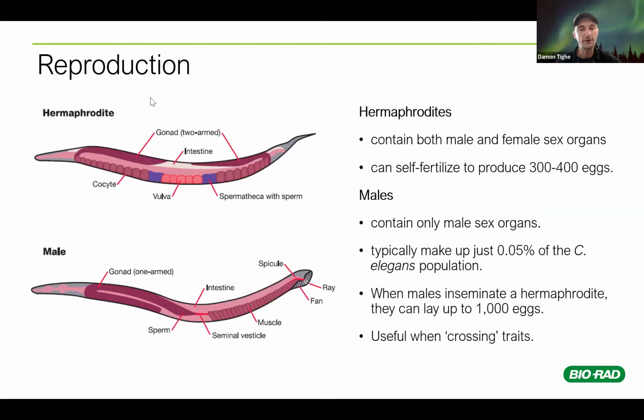The way you can tell them is that under the microscope, the males will have a fan tail at the end. And like Lee said, she's never seen one. I've only seen one when I was visiting a high school and they were running this. So they are kind of like an Easter egg hunt, mythical to find. Yeah, they're magical. They're basically unicorns.